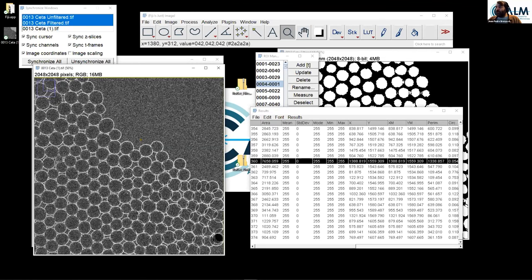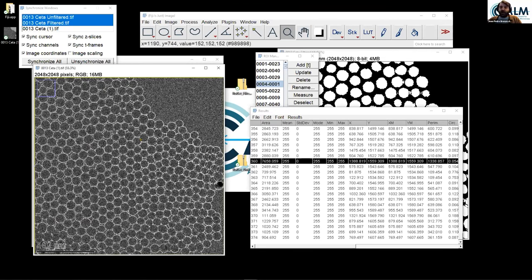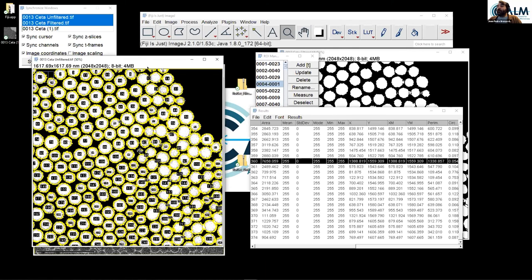I tried to go through the same sequence of rationale as Alex did. One thing that I'd like to leave you with, as a transition for the next session, is that so far we've been dealing with 2D arrays. This is a 2D image. But as you are probably aware, we can do 3D arrays and multiple dimensions in acquisitions at the microscopes. And the tools that we are providing you today also work on those different arrays.